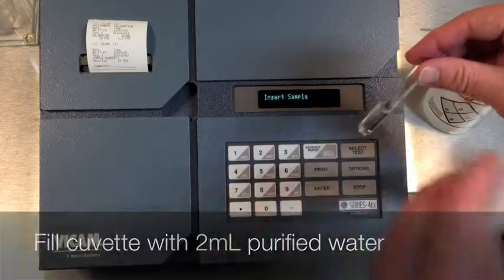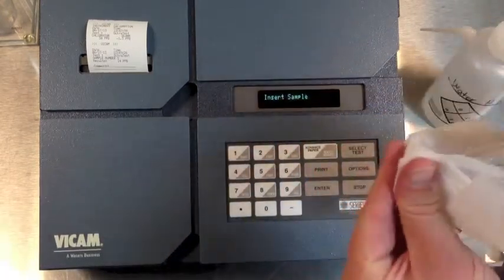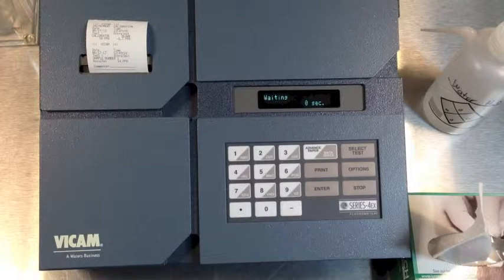Next, we will test our purified water fluorescence. Put 2 milliliters of purified water in a clean cuvette. Insert into the machine and then confirm the result is zero.